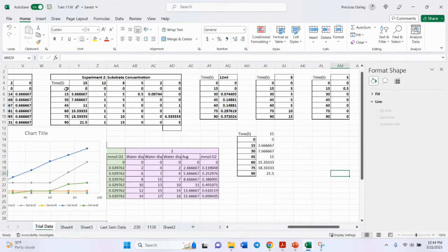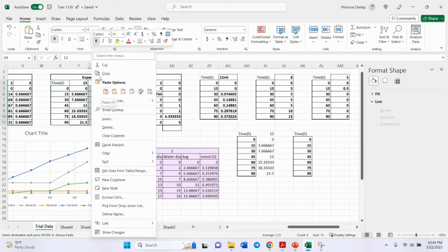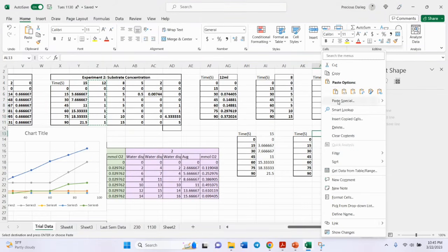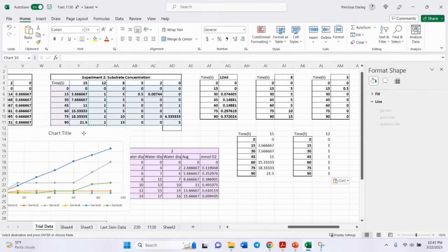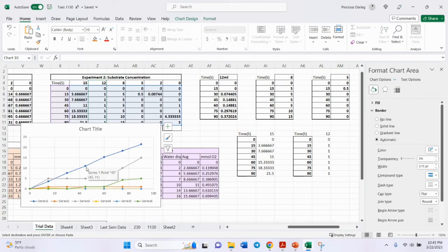So something like that. Then same thing, I do the same thing. I do a time, copy. This one doesn't matter because there's no formulas in it, so I just copy that. And if I'm going to do the 12, do this and then copy and then paste values. If you are confused about why that is, I guess you can just also type it. That's fine, right? So to continue my example, if I need time 45 to time 60, then I'm just going to do that for time 15.